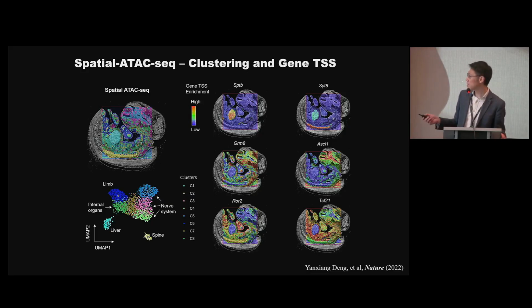You can look at those individual genes, but just to keep in mind, what you are looking at is gene activity, epigenetic state. This particular gene is associated with erythropoiesis, or red blood cells. You see this exclusively in liver, because at this particular stage, liver is the organ producing red blood cells, not bone marrow. You can look at many other genes.